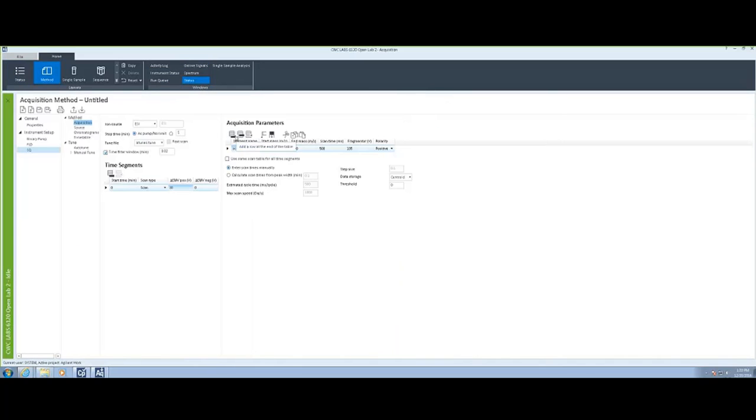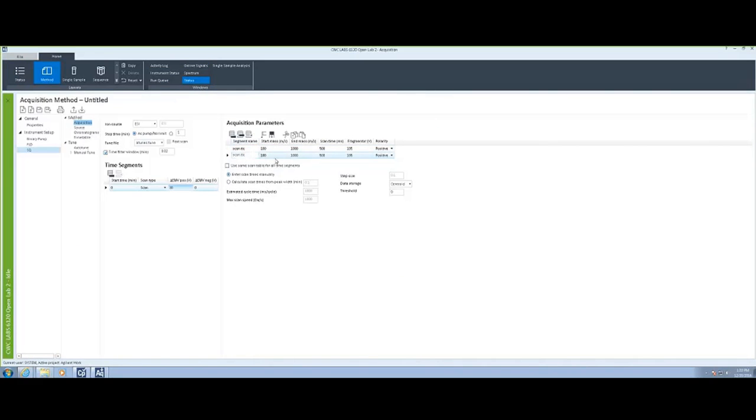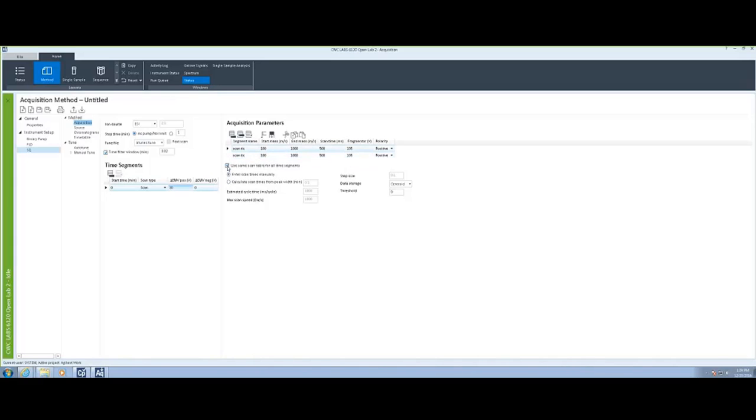Selecting the method icon, I can now define the MassSpec signals I'd like to acquire. I can also put in different time segments. So if I would like to have one time segment where I'm scanning something and another time segment where I'm scanning it wider, I can do that.